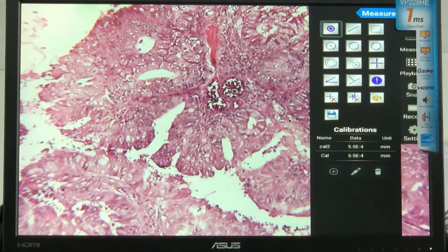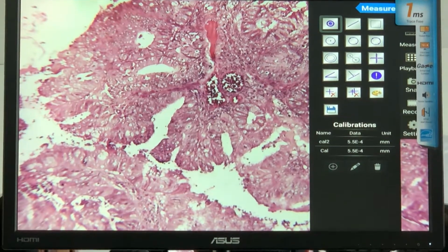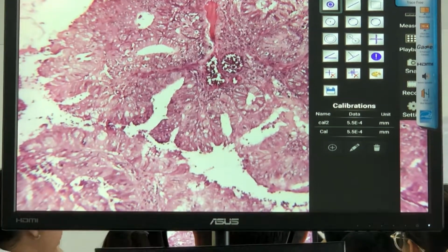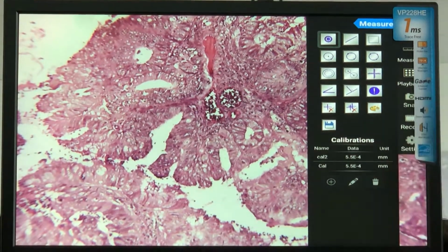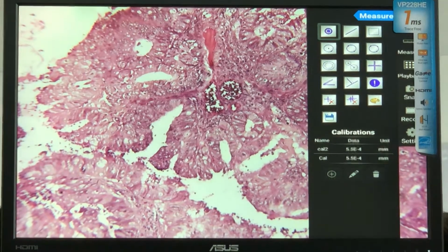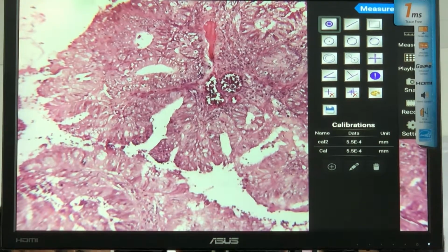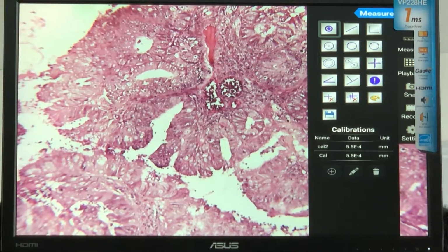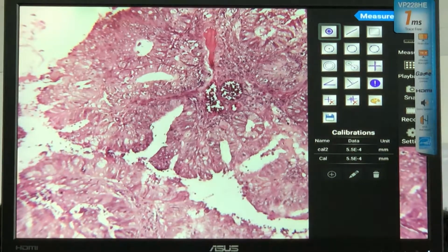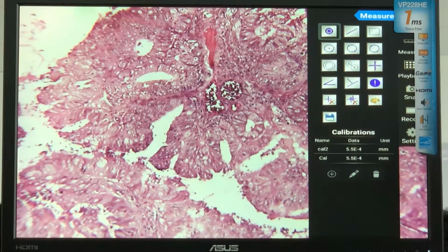So that is not simple. When I mark this, how would you know this is an endometrial gland? You will know this is an endometrial gland because there are many of those villi like that. Those were endometrial glands. But in real life, you should label this because sometimes it looks like an ileum. But one thing that will make you think this is not an ileum is that ileum is simple columnar. This is not simple columnar. So this is something very doubtful.